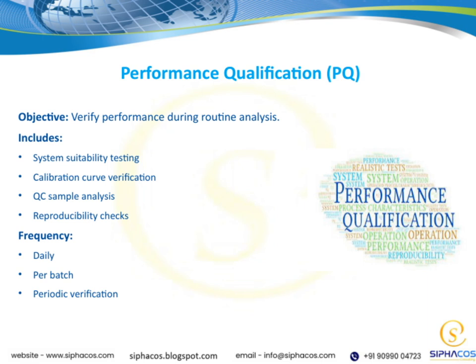Now, regarding how often we perform these checks, it varies. Some are done daily, especially before starting routine work. Others are done per batch to ensure each set of analysis maintains quality. And of course, periodic verifications are important to catch any long-term drifts or issues. Connecting this to our overall quality approach, PQ is fundamental because it ensures our method remains valid and trustworthy over time, supporting the integrity of our data and compliance standards.